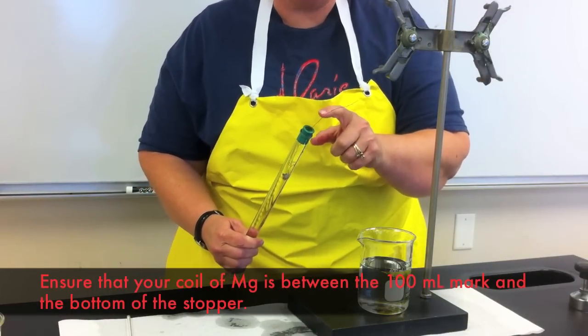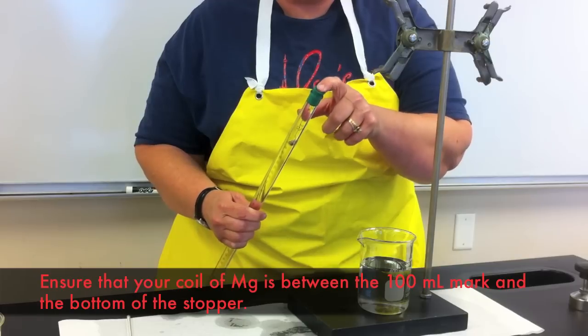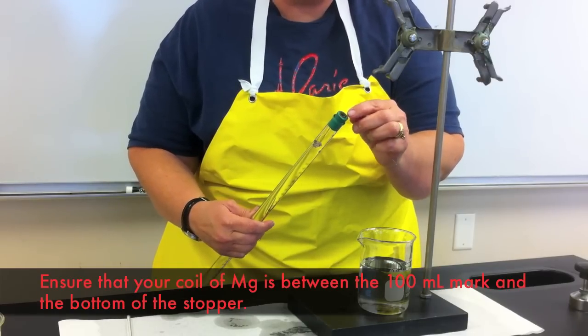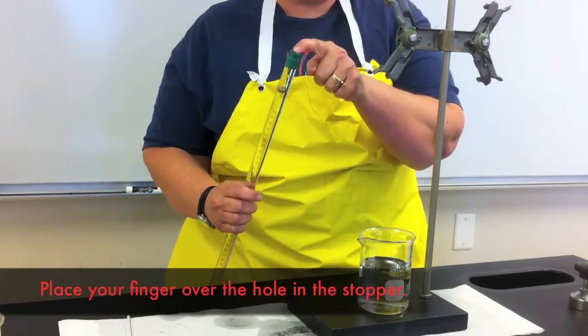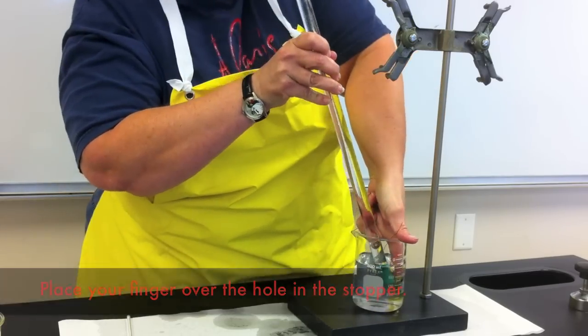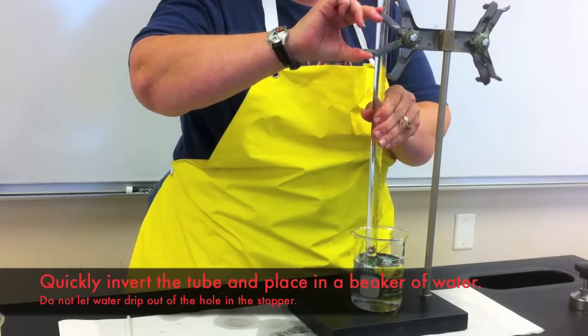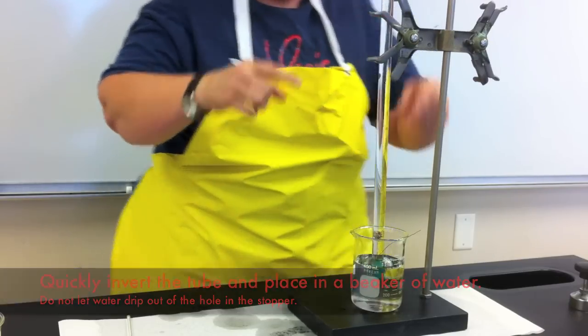Leave a long enough length of copper wire so that the coil of magnesium ribbon sits between the 100 milliliter mark and the bottom of the stopper. To begin the reaction, place your finger over the hole in the stopper and invert the burette into a beaker of water. Use your ringstand so that you can clamp the burette in place. Be very careful not to lose any water from the burette tube during the inversion process.